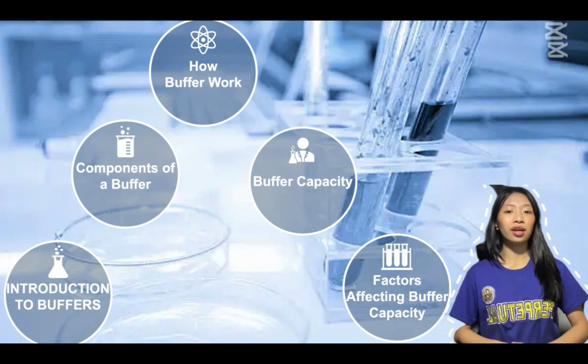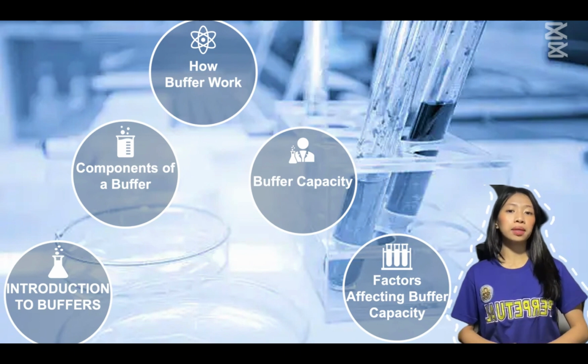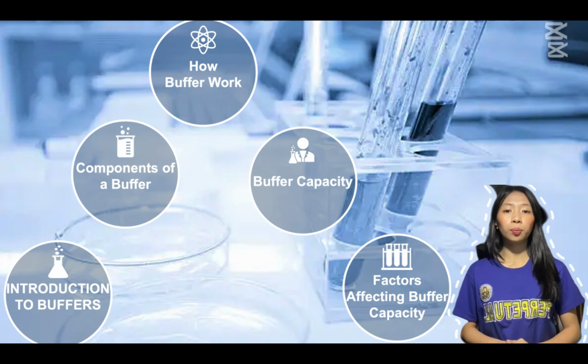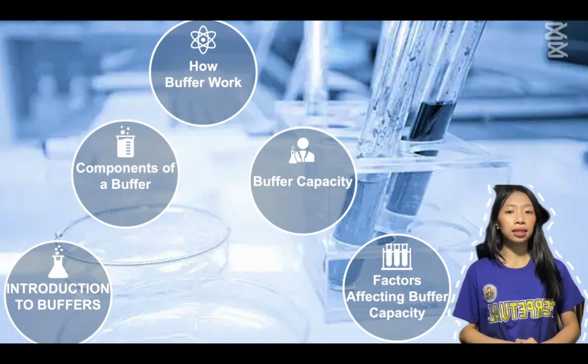So let's get started. Welcome to the world of buffers, where chemistry meets balance and stability. In this lab, we're diving into the fascinating world of how our bodies and even industries keep their pH levels in check no matter what gets added to the mix. First, we will explain what buffer and buffer capacity are.